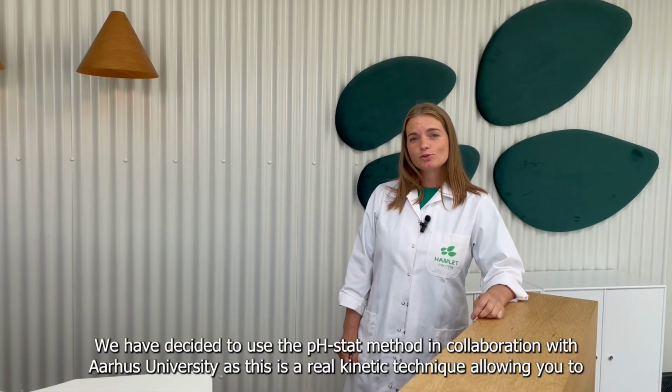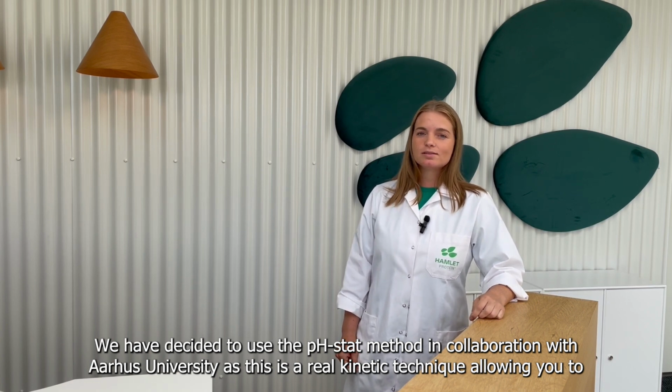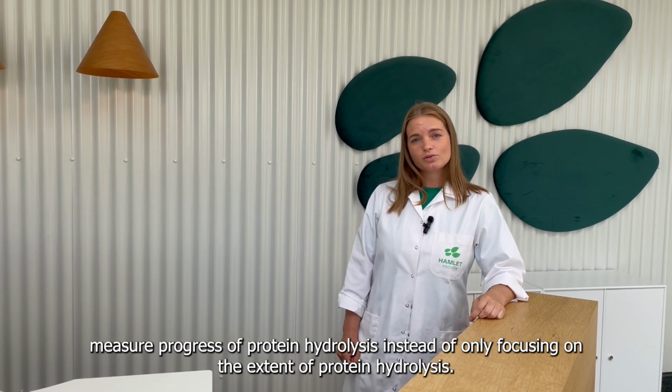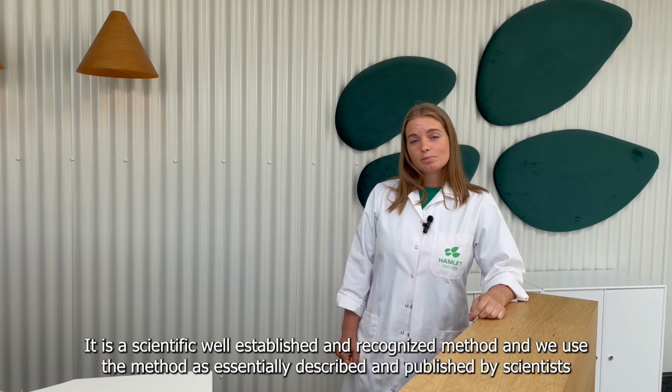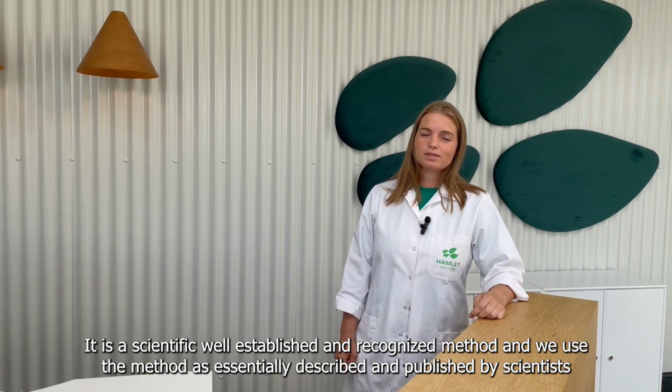We have decided to use the pH-stat method in collaboration with Aarhus University, as this is a real kinetic technique, allowing you to measure the progress of protein hydrolysis instead of only focusing on the extent of protein hydrolysis. It's a well-established method, and we use the method as essentially described and published by scientists from Wageningen University.